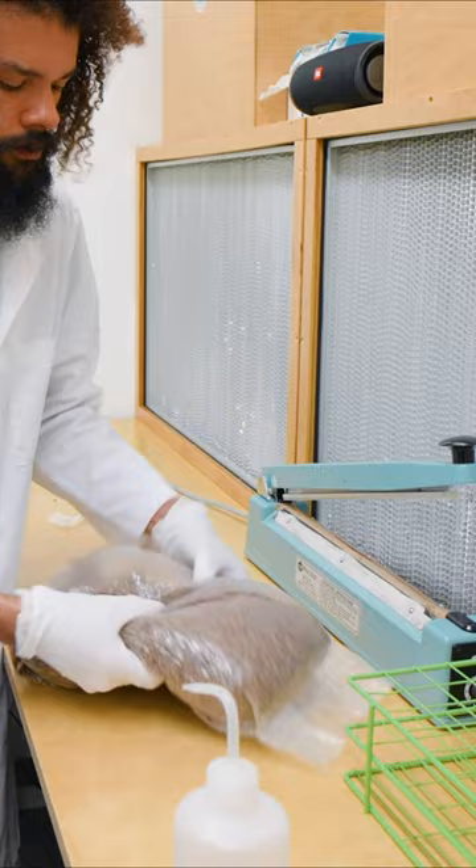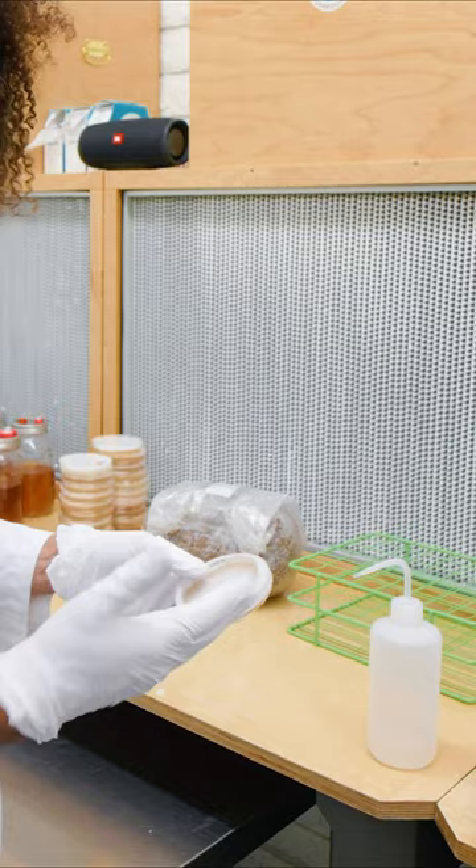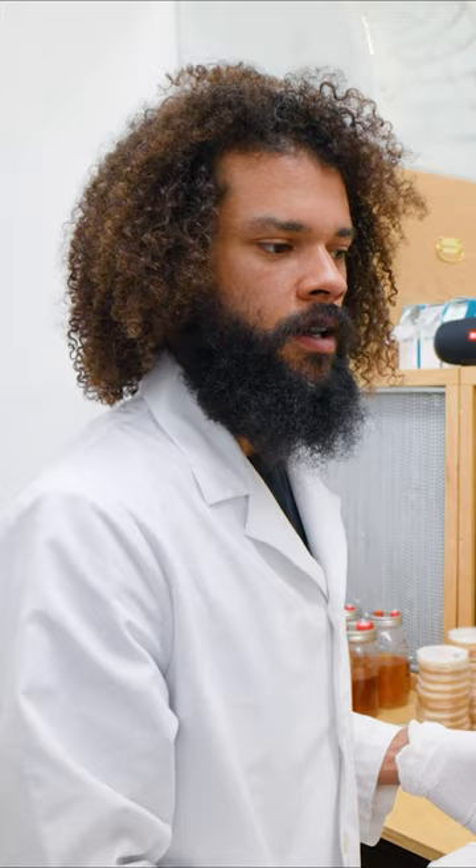That will be called the G1, or Generation 1 bag, and then that will be used to produce 10 more Generation 2 bags, and from there we can move those into production bags.